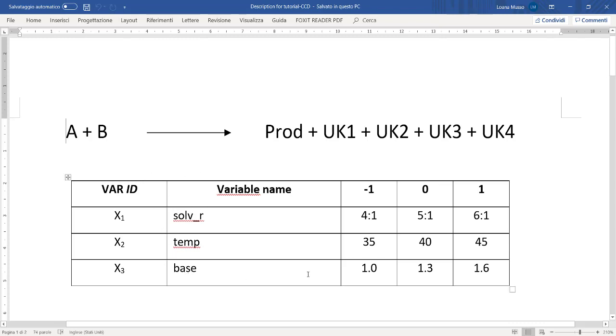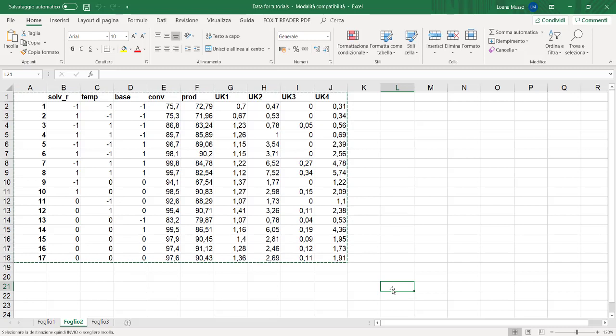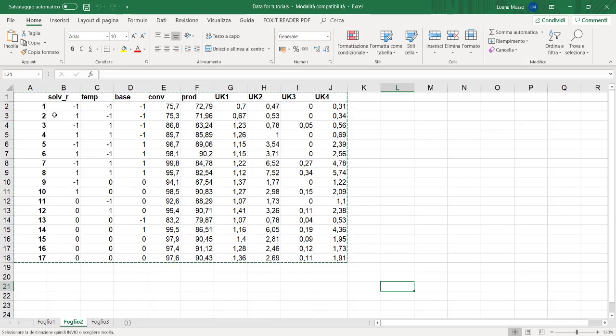Each one studied at three different levels: minus one, zero, and plus one. In this other table we have the full matrix with the first column that is the tag of the experiment, so each row represents one experiment.